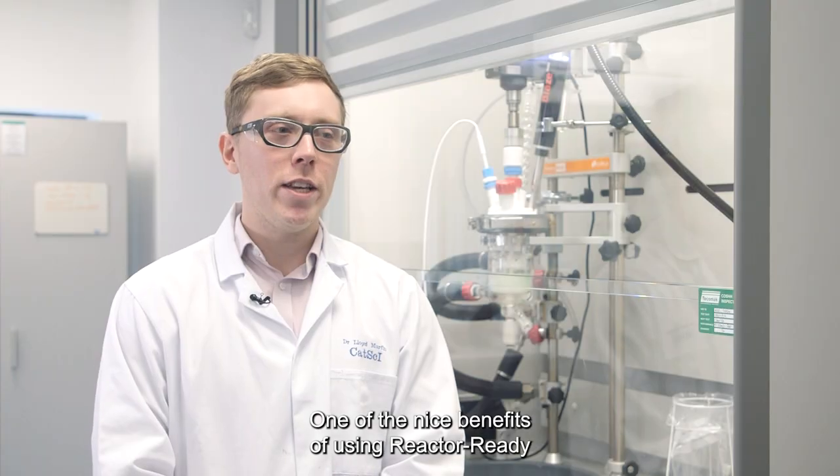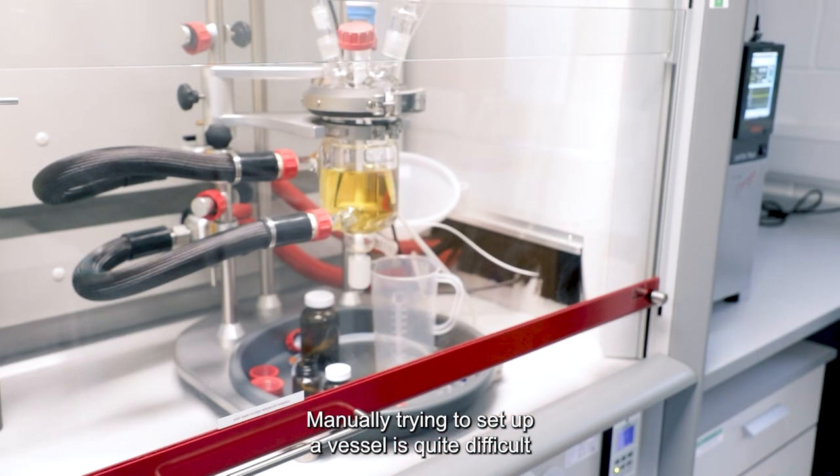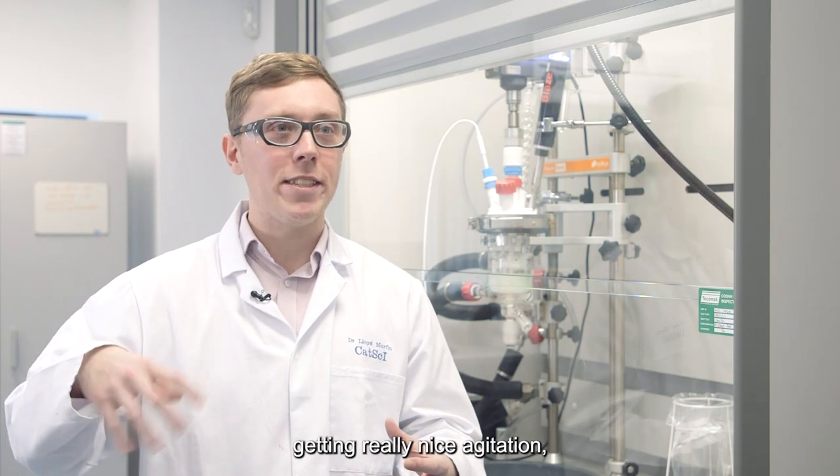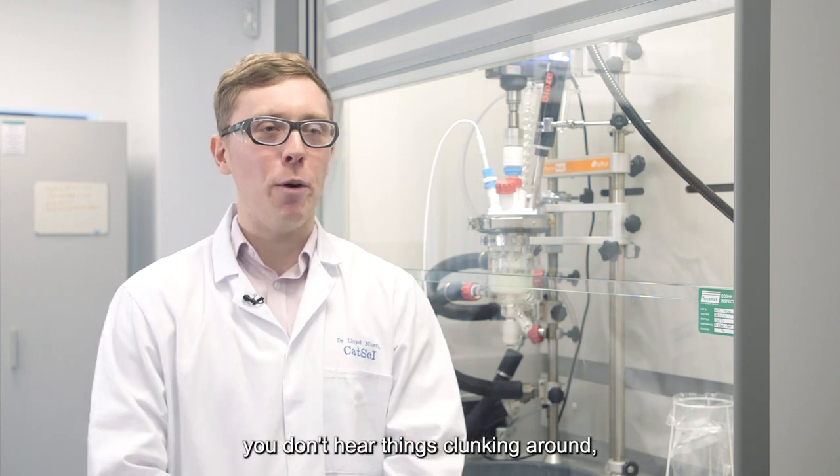One of the nice benefits of using Reactor Ready is just how easy everything is to piece together. Manually trying to set up a vessel is quite difficult, but being able to quite easily adjust your overhead stirrer, getting that set up appropriately, getting really nice agitation. You don't hear things clunking around. They run really quietly.